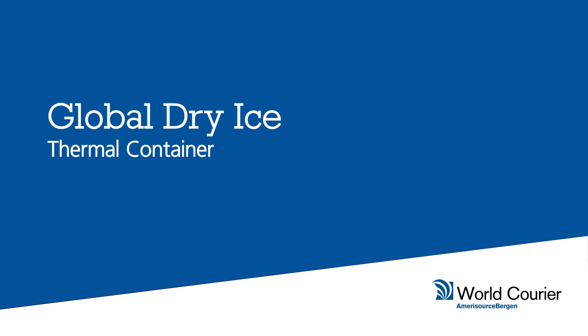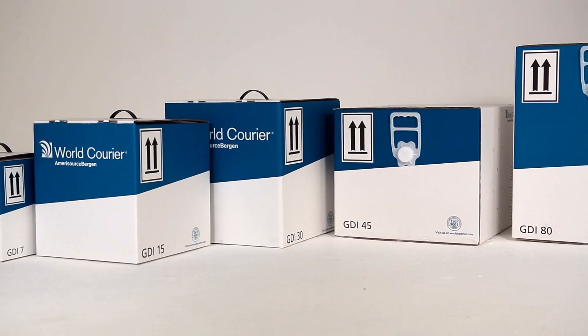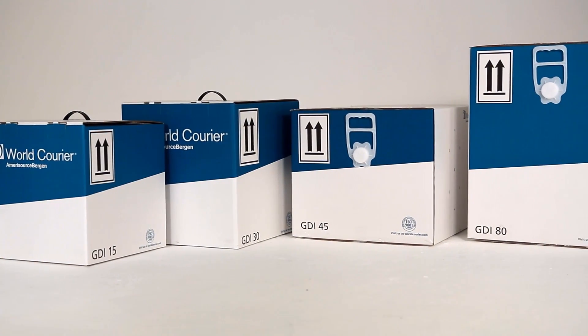World Courier Global Dry Ice Thermal Container. Used for patient samples and some deep frozen pharmaceuticals.